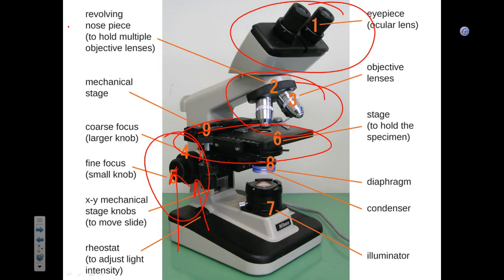It's too far. I'm not trying to be dismissive, but before you think there is something wrong with your slide, it's probably fine. You made a fine specimen, but you're just too far. If that's the case, go back to scanning and start over. Does that make sense? The easiest way to find the specimen is to go back to scanning and start over. Make sense?